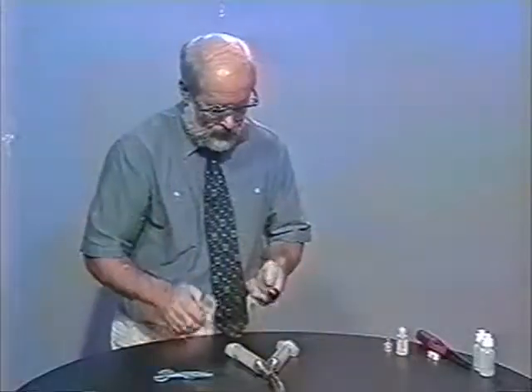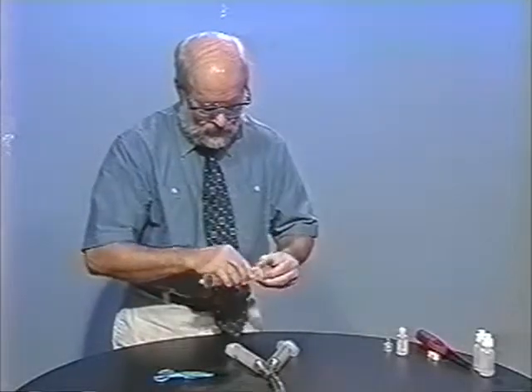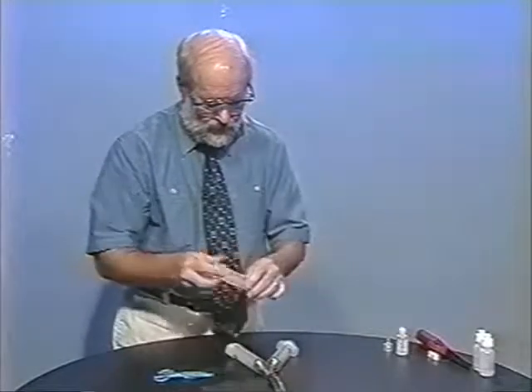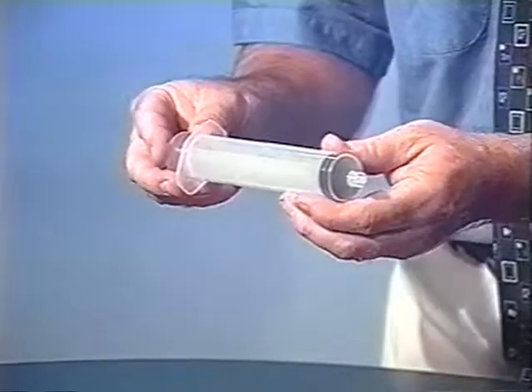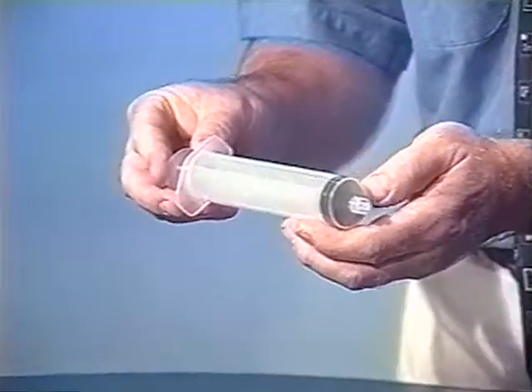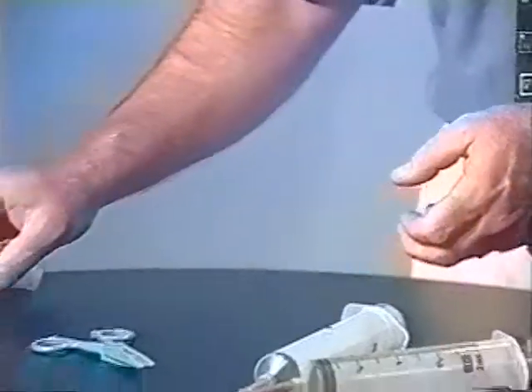I've lubricated the plunger to have this one ready to go. It's also a good idea to not have the plunger completely seated, because for some reason it has a hard time getting started moving up through the barrel. So I always take it off the bottom by just a tiny bit. We'll set that aside.